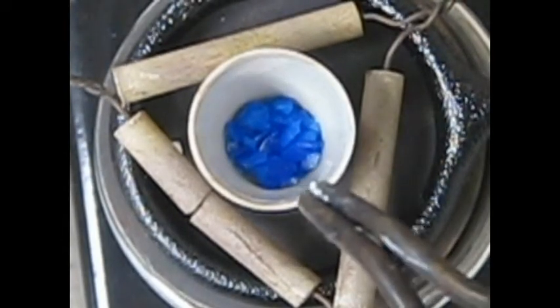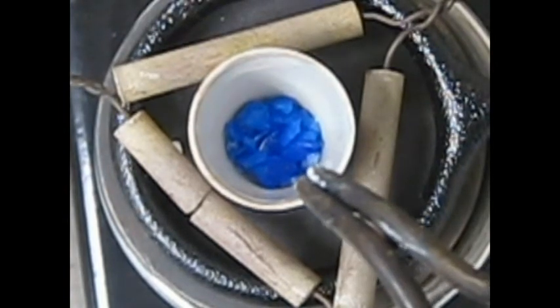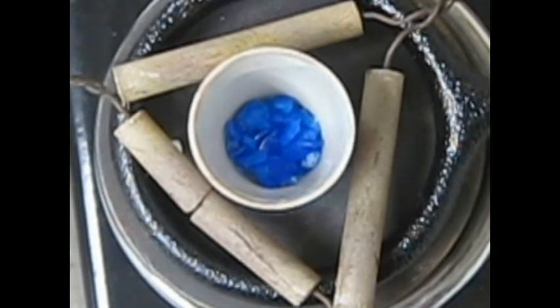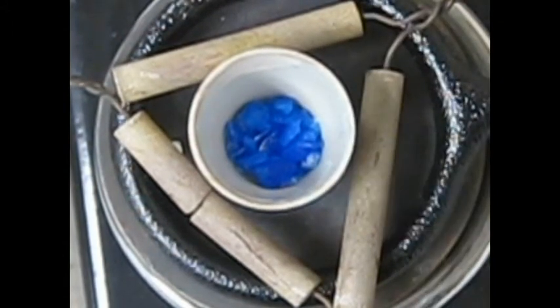Okay, so I'm going to leave this running, and it takes approximately maybe less than 15 minutes, and then we're going to see the mass of the dry salt. We'll be able to figure out how much water has been lost.